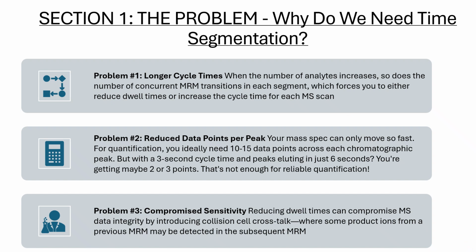So, we are stuck between a rock and a hard place. We need to monitor many compounds, but our instrument has physical limitations. This is where time segmentation comes to the rescue.